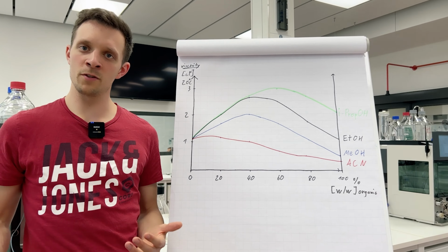So in the worst case, not every application can be carried out at its optimal flow rate if you are using large cartridges, for example 3 or 5 kilograms. Otherwise, the maximum pressure of your cartridge will be exceeded.